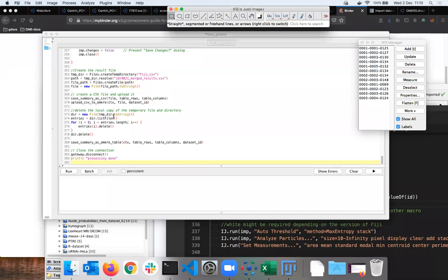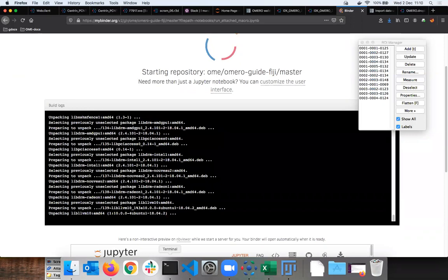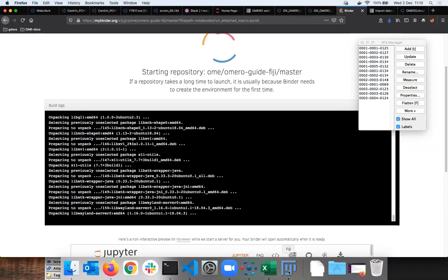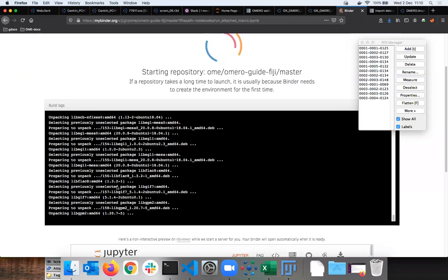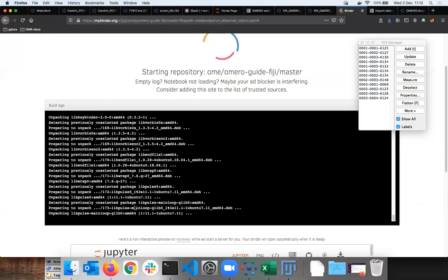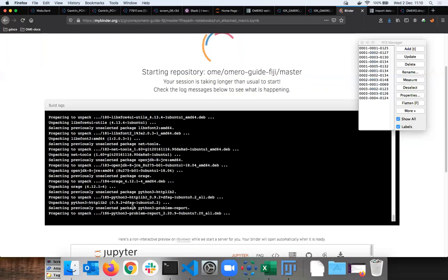There is a long wait, which is caused by the fact that I'm locally here on my broadband in a private flat in Dundee. Whereas if I create an environment somewhere else on the cloud, then I will bypass the broadband connection, which is sometimes not that great, and I can run my Fiji on the cloud, which is just happening here for you, and then fetch the images from the server, which is remote, to a place which is remote.